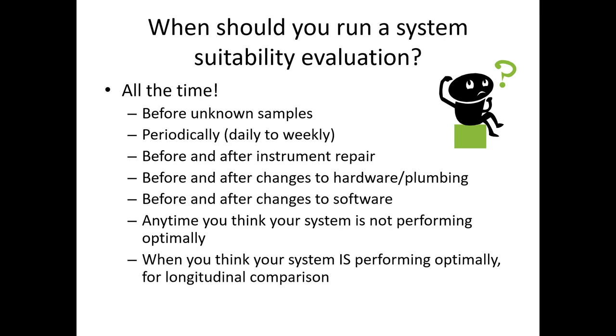And anyone who's a Skyline daily user knows, if you ask for a feature to be included in Skyline and then there's a daily release, every now and then there's another daily release an hour after that first one, because sometimes when you implement a change in the software, you break something over here. So keep in mind that software upgrades you should take with caution, and always make sure that you're doing testing before and after, because it controls your instrument.